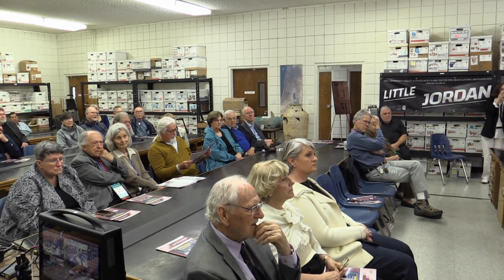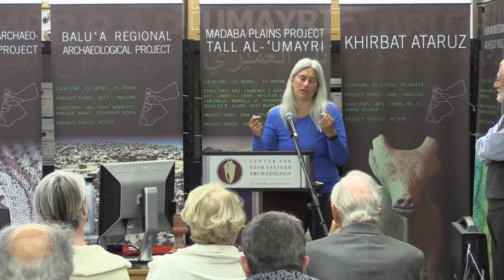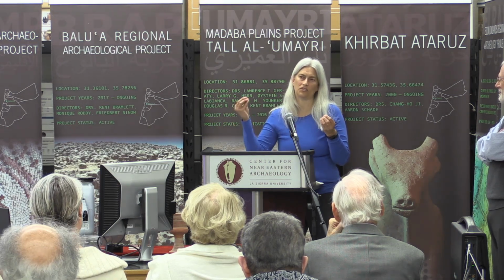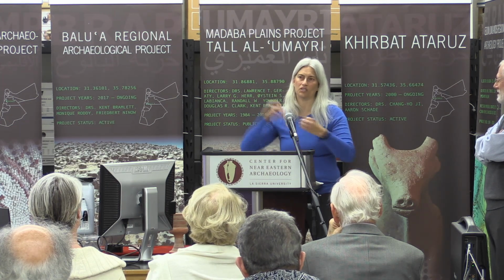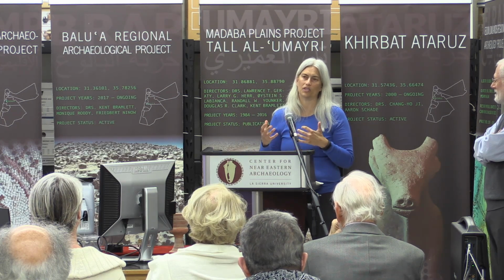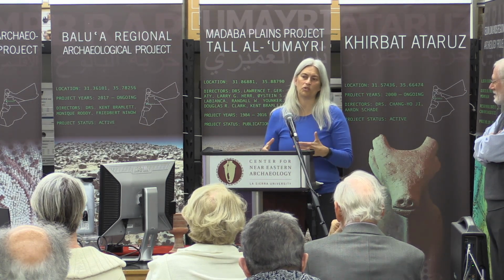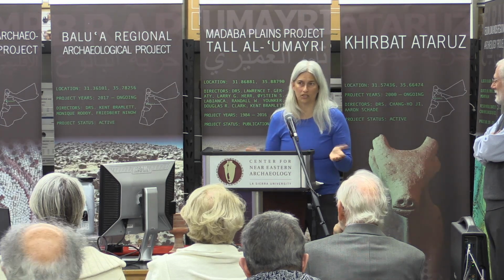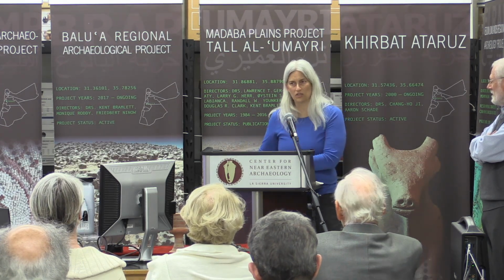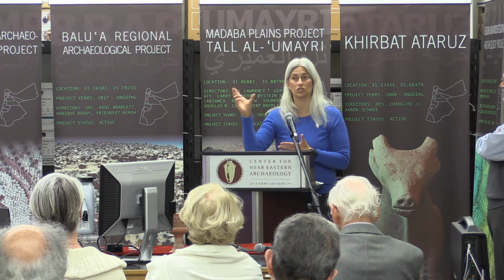Yeah, so at the bottom of the scale is energy, and it's measured for X-ray fluorescence in electron volts, which is a very interesting measurement of energy. But by tradition, each kind of spectroscopy has its own measurement of energy and how it displays it. And that's one of the really interesting things about transitioning between the different ways that we measure things in chemistry and physics and archaeology. So in chemistry, we measure traditionally in electron volts for our X-ray fluorescence, but we can convert that into joules, and joules is the SI unit for energy. And we can measure the visible wavelength of light in joules.